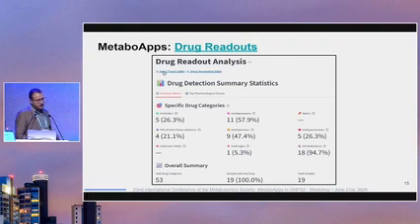So you have two options to download. I mean, you know that you already have that data on your GNPS job, but if you want to check the input quantification table or the annotation table that is being analyzed by the app, you can always download that as separate tables just to check anything. And the metrics are based on the classification that is based on the library.